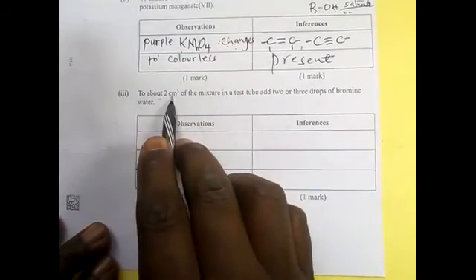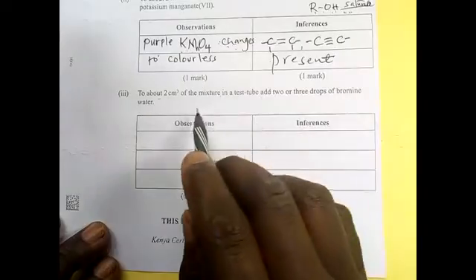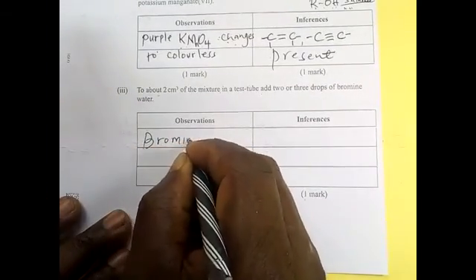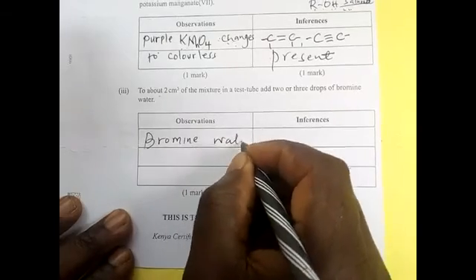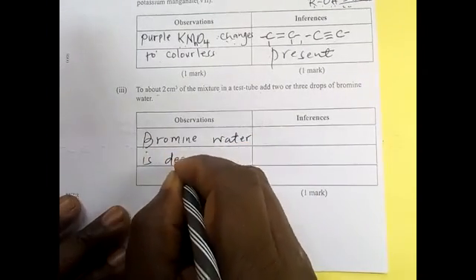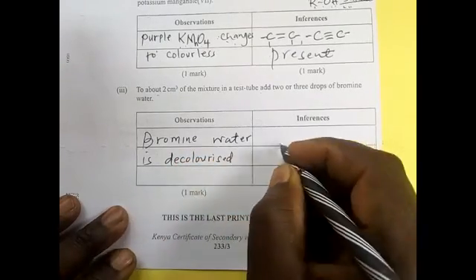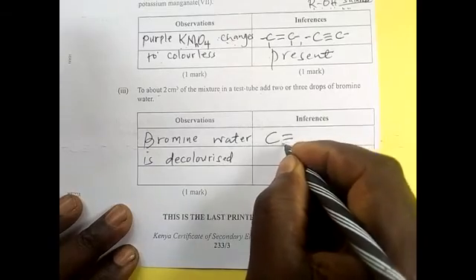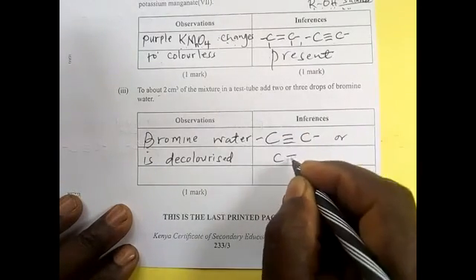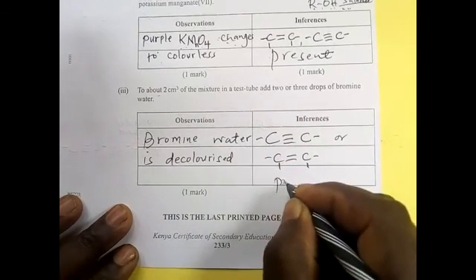To this mixture, add 2 or 3 drops of bromine water. And bromine water is decolorized. And that also says that the triple bond or the double bond is present.